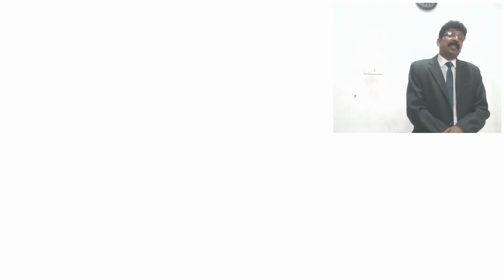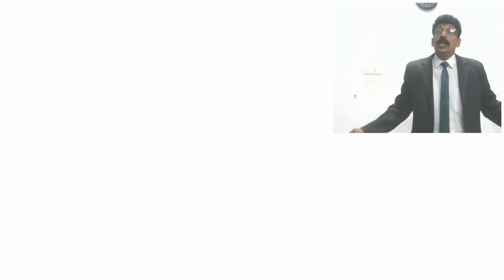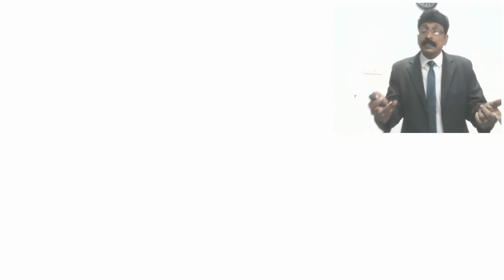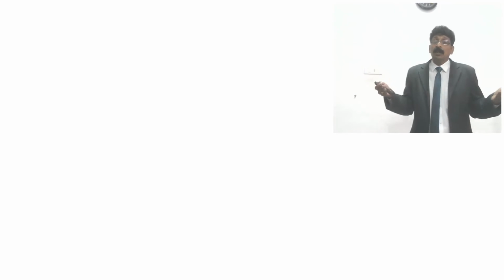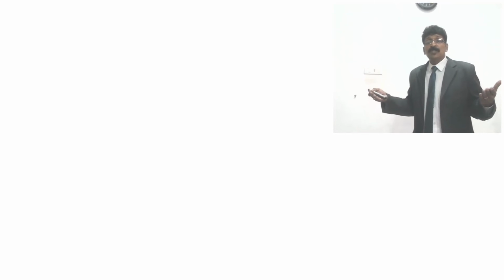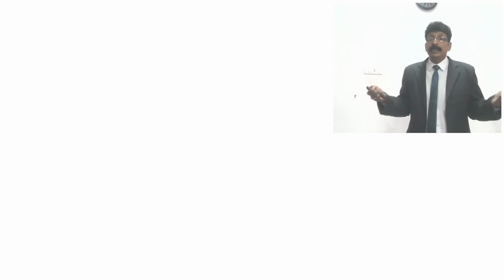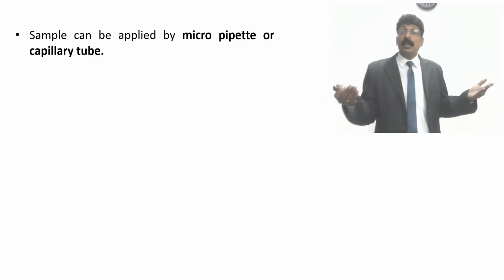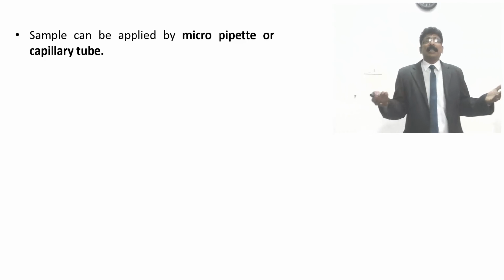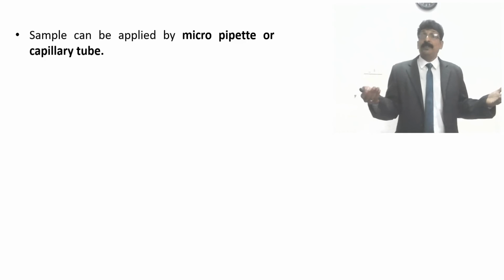When it is solid it should work by adsorption. Chromatography means it should have the capacity to adsorb the compound and make the separation. So there should not be any unwanted water, which was used for the purpose of making the thin layer; it should be removed. So 110 or 100 degrees centigrade for at least 1 hour should be kept in the hot air oven to get activation of the thin layer chromatography plate which is prepared by us.